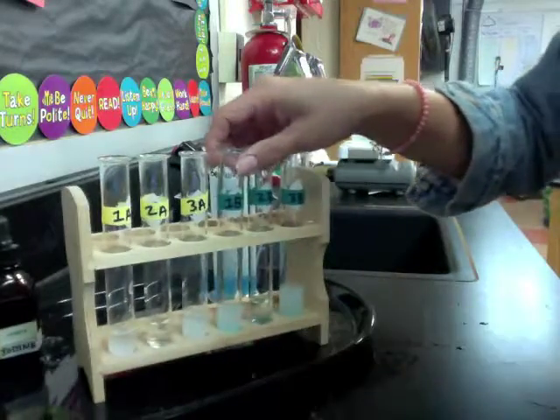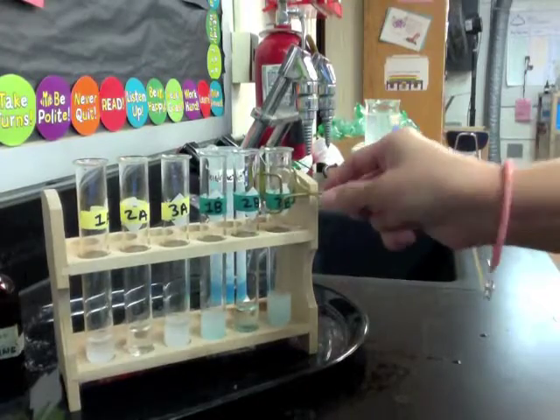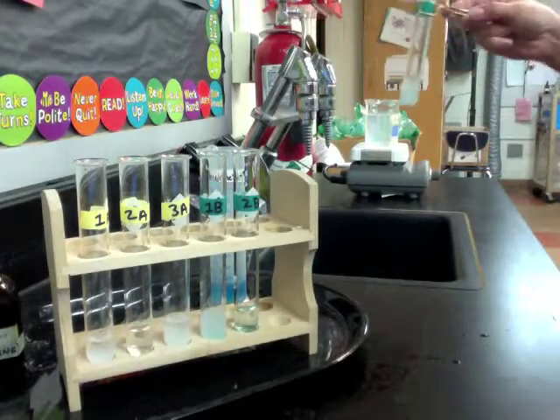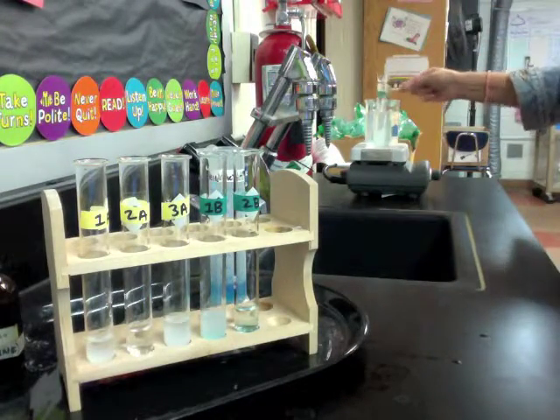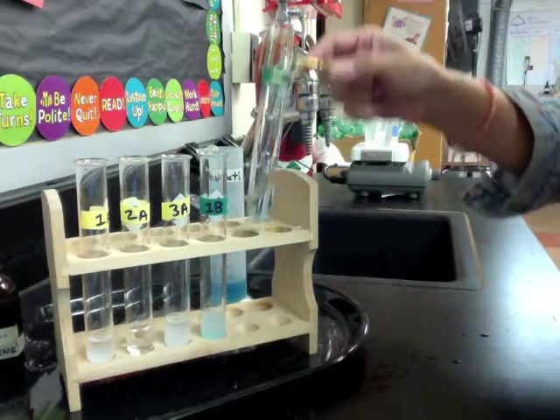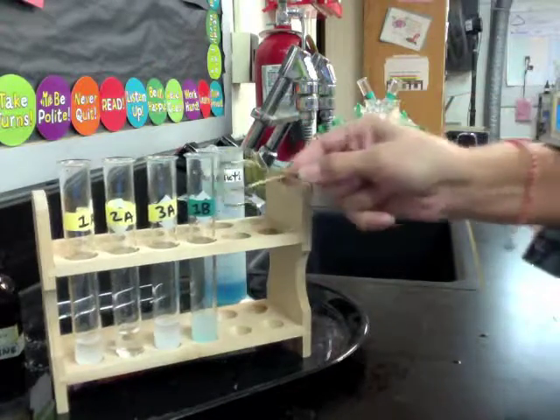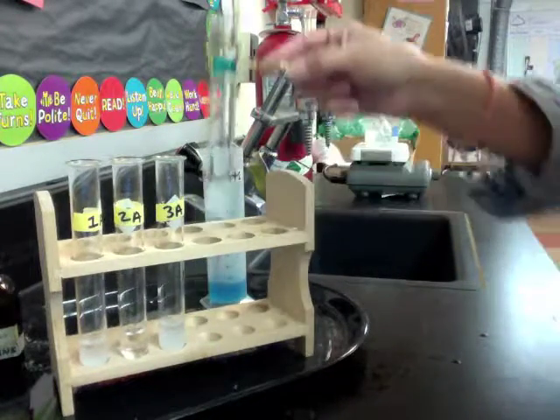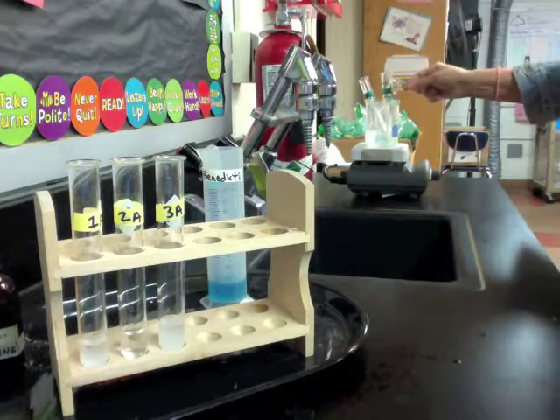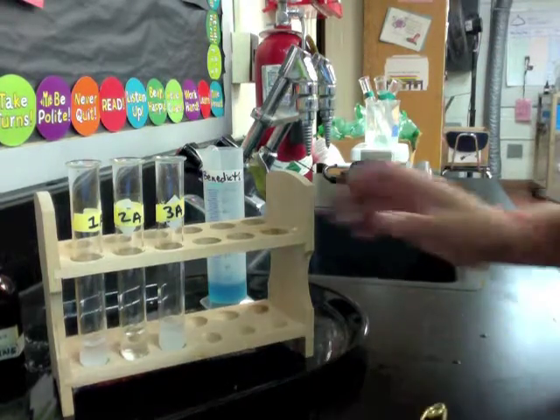What we're going to do next is we can grab these with our test tube holder, and we're going to gently place them into our hot water bath that's been set up at our station. So make sure all three test tubes go in — those should be the green-label test tubes — and we'll let those sit in the hot water bath.